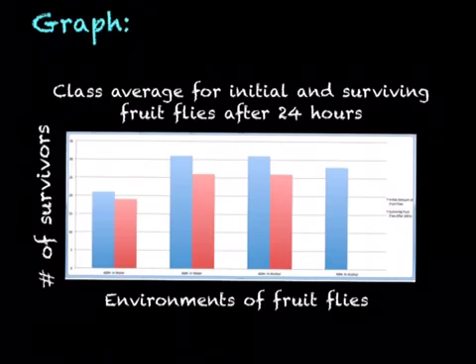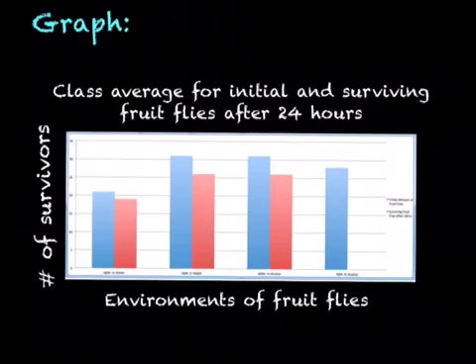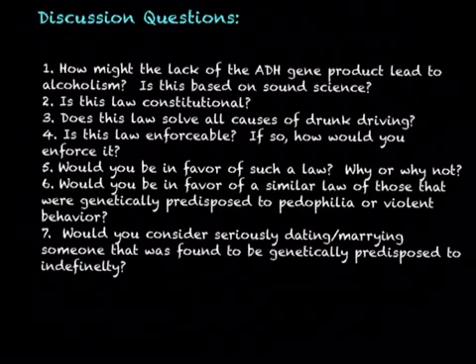This supports our hypothesis that the flies in the ADH minus in alcohol weren't going to survive, while in the other ones, they will remain alive.